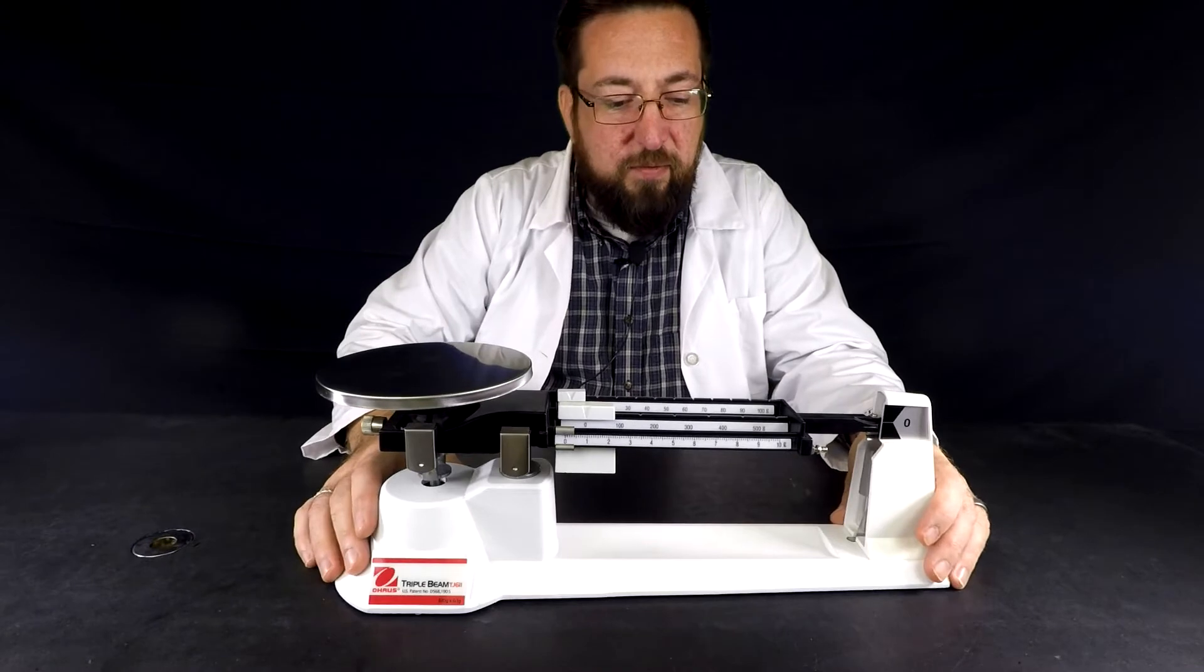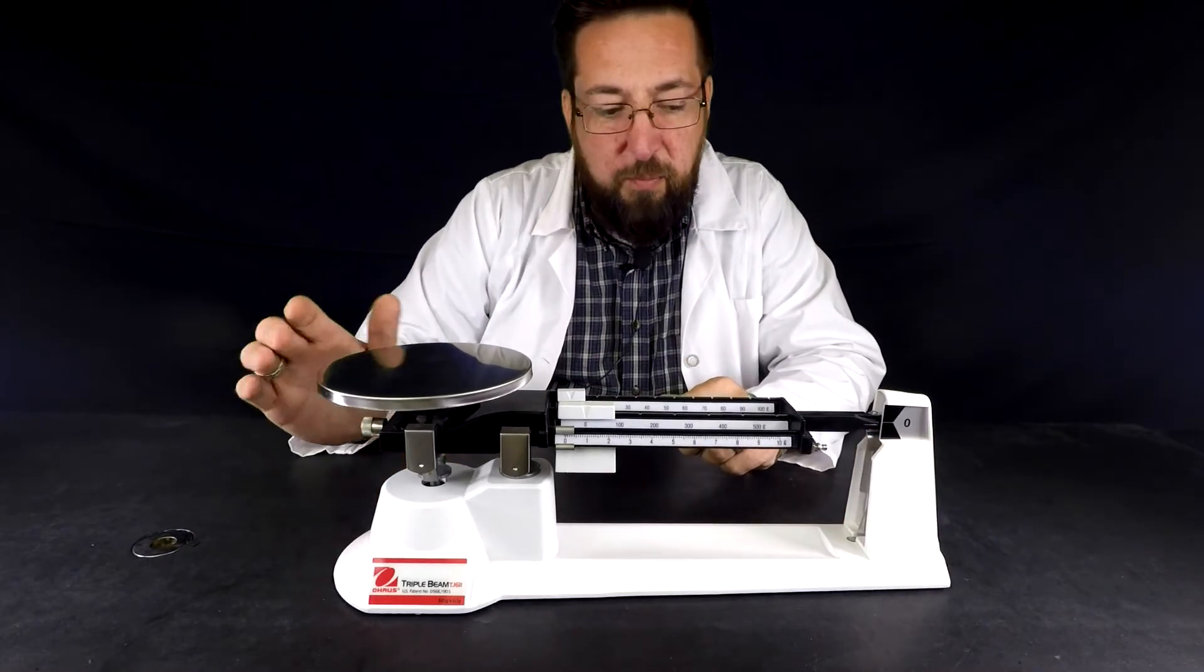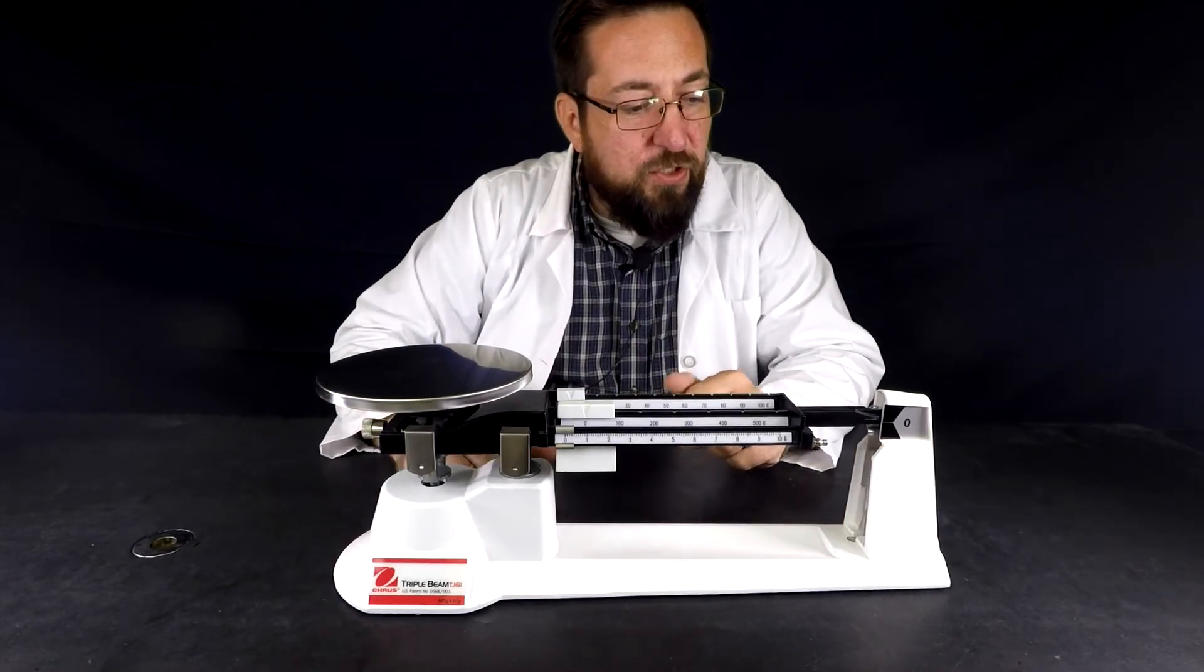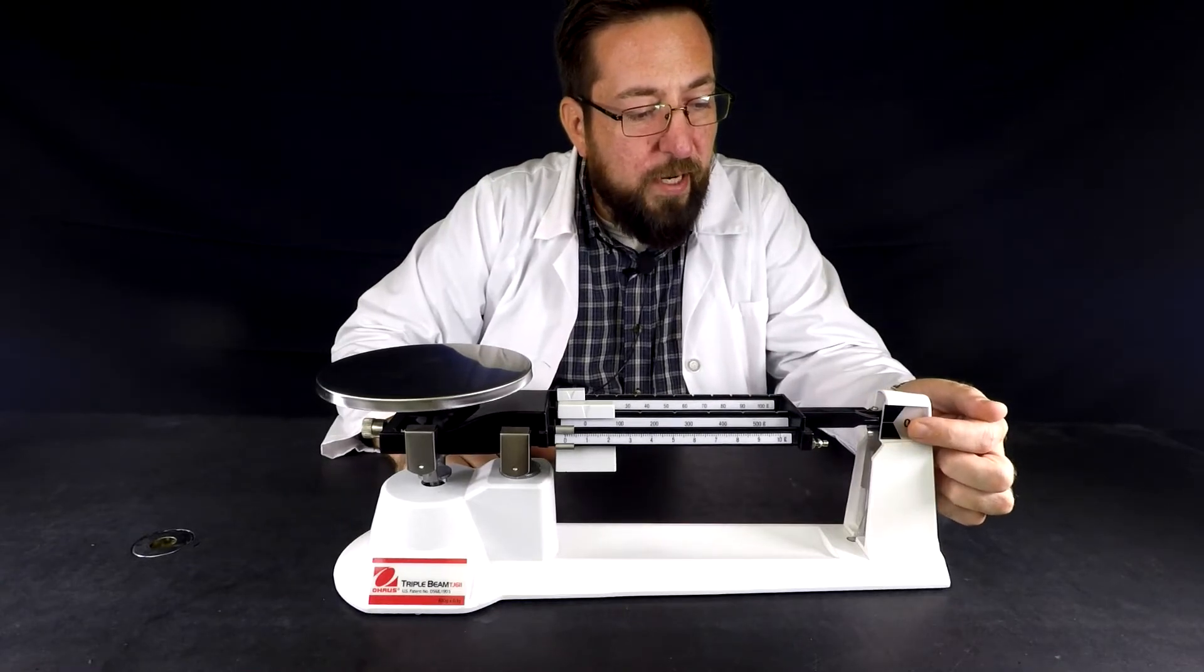So after I've moved all the riders to the left, cleared off the pan, I next want to check and make sure that the zero marker is reading on the line correctly.